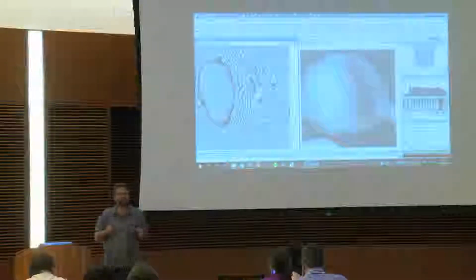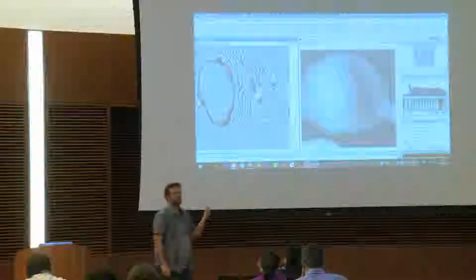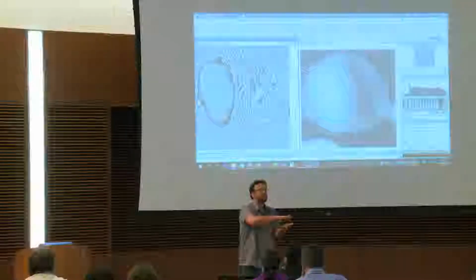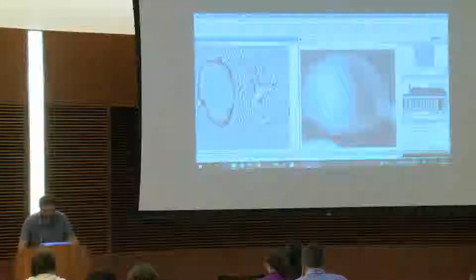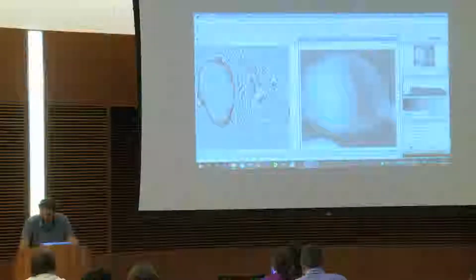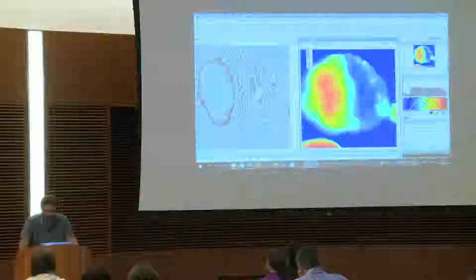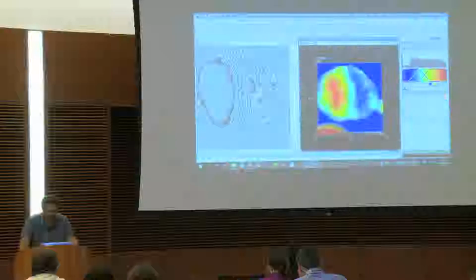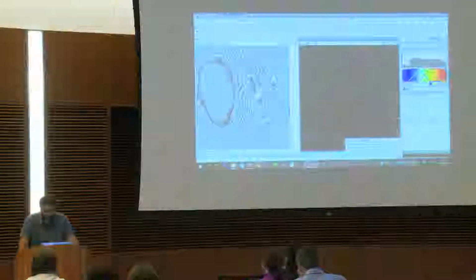Okay, so now what we can do is switch to 3D. But you agree that it is not the same 3D as before. It is 3D, an extrusion 3D. We call it an elevation map. So I will do it with this image here. Before, I will switch to this kind of lookup table, so it's easier to see. I don't go to 3D VTK, but I go here to this one. And now I have my 3D view of my sample.